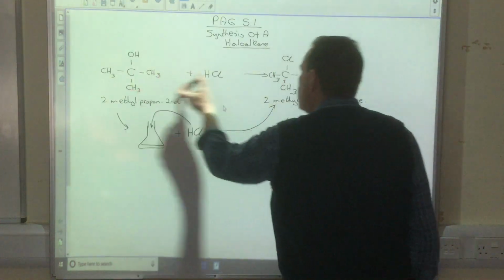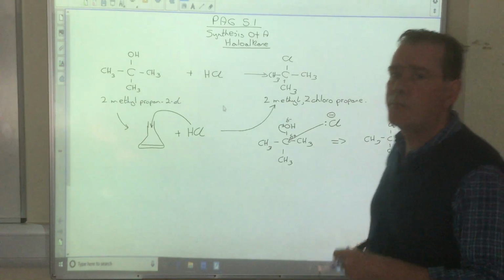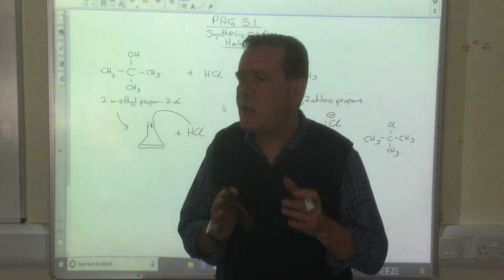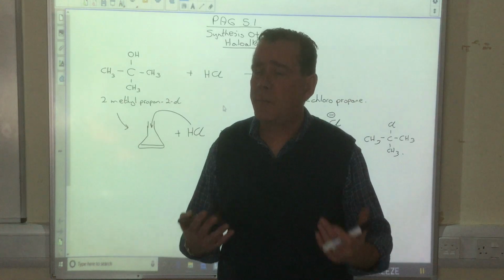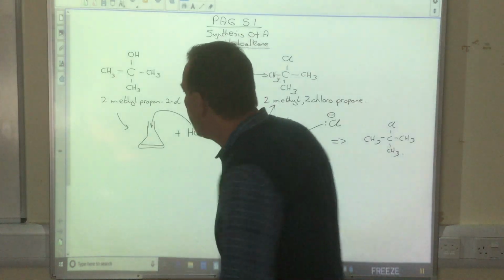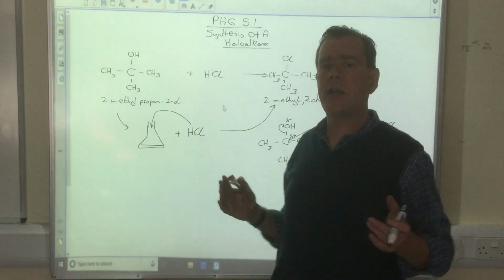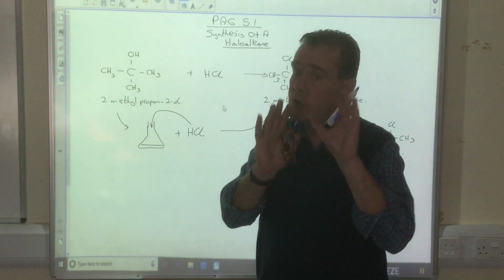Now, you do this reaction, what do you end up with in the conical flask? And this brings me on to probably a more important part of this, separating out the mixture of organic products. We've looked at separation techniques with distillation, but this is a new separation technique using a separating funnel. Now, I don't want to wipe this off just yet, so we'll keep it on. What's in here? Because you don't get 100% reactions, do you? It doesn't work like that. You always get a mixture of different products.